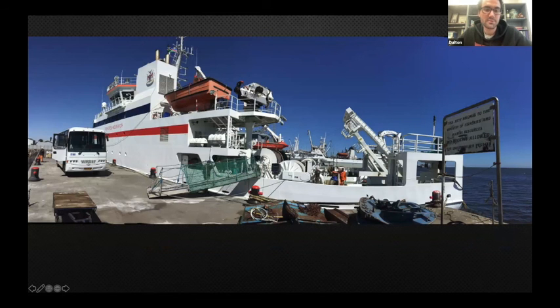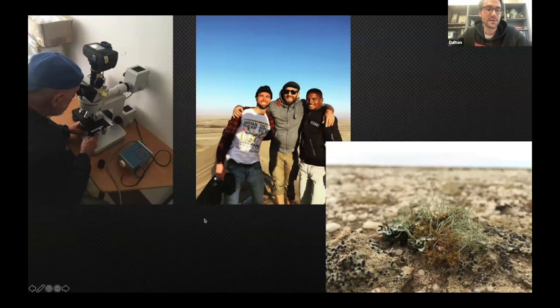There was the Mirabilis. That was a great time. Here's Kurt. He was showing me how to use the fluorescent microscope over there, where we initially started doing some of this imaging with some different dyes, but this is where it all kind of started, measuring the acidity within Thiomargarita all originated here.